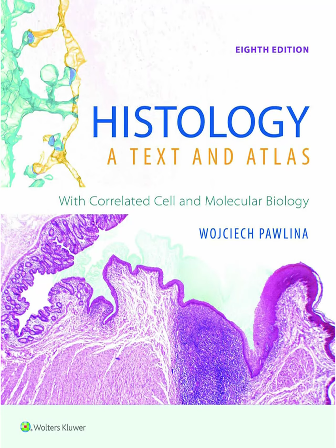The hydrogel swells up, expanding isotropically, uniformly in all directions. How much bigger? Standard protocols get about a 4.5-fold linear expansion. That's over 80 times in volume. And iterative methods can go even higher, maybe 20 times linearly. Things that were too close together get pulled apart. Exactly. Molecules or structures that were closer than the 250 nanometer resolution limit of a standard light microscope get physically separated. Now they are far enough apart to be resolved by that same conventional microscope. It effectively gives you super resolution, maybe down to 25 nanometers or even better using standard equipment.